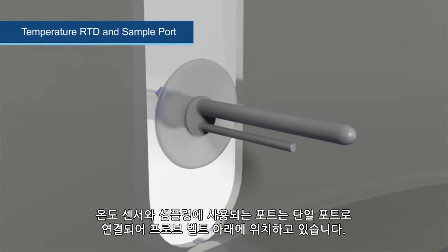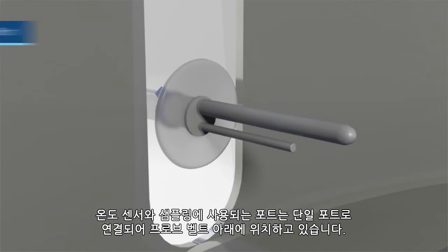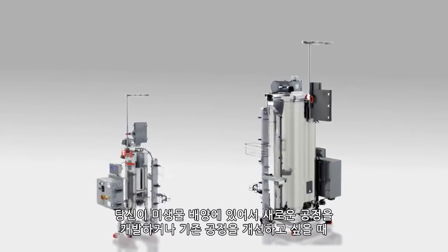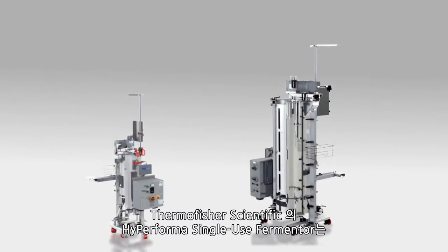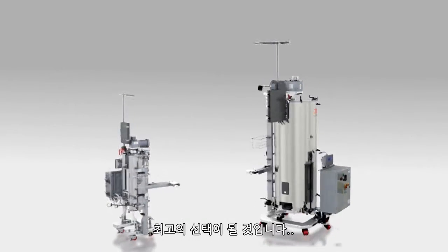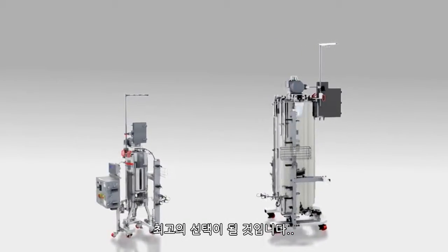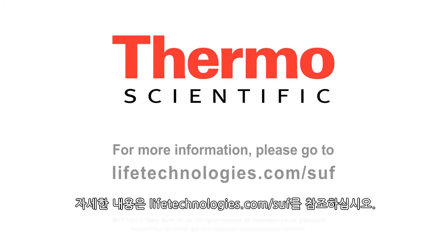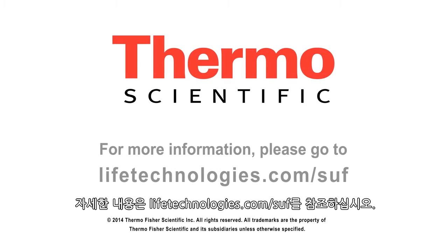Temperature well and sample port are conveniently combined into a single port and located below the probe belt. Whether you're developing a new process or seeking to improve existing processes, the Thermoscientific high-performance single-use fermenter is the best choice for scalable fermentation applications. For more information, please go to lifetechnologies.com/suf.